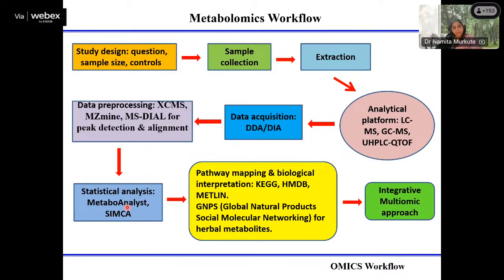Now further you get such a list of metabolites generated through your machine, and it will show you the list along with your confidence, how much percentage confidence you have in identifying that compound, and then it will show, which is very important, the retention time and mass of your compound.